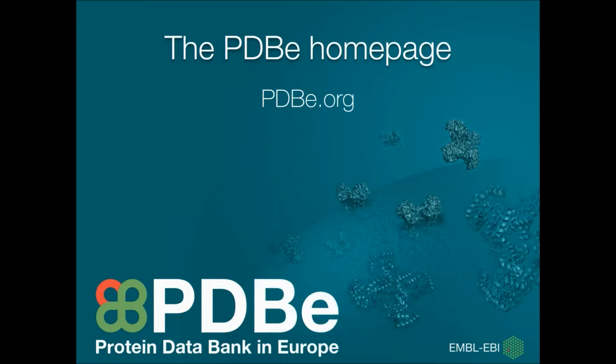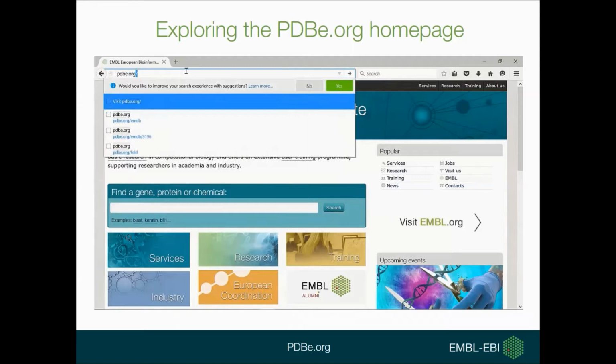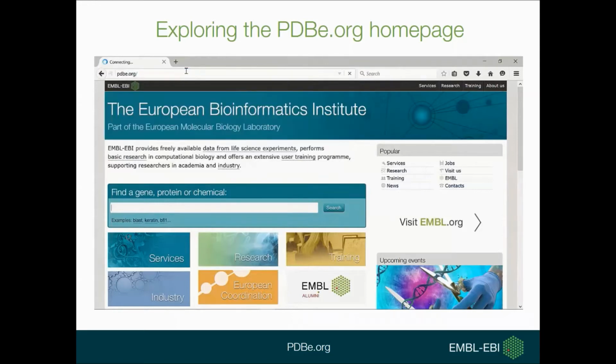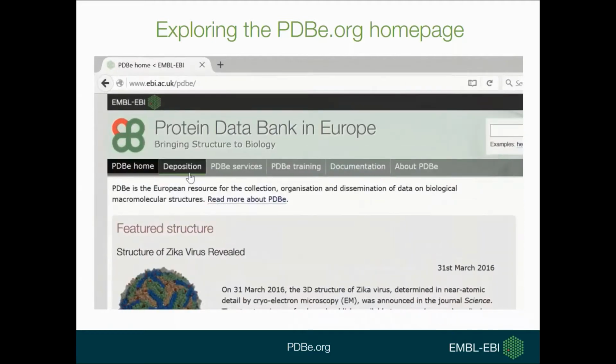Our homepage at pdbe.org is your starting point for information on macromolecular structures. So I'll show you how to get there and what you can find on the homepage. So to begin with, you can type pdbe.org into your browser, and that will take you directly to our homepage. There are some tabs at the top of the page here to navigate. If you want to deposit structures, you click on deposition.